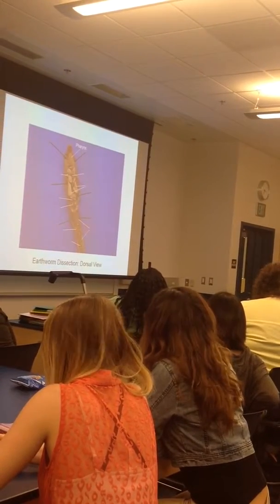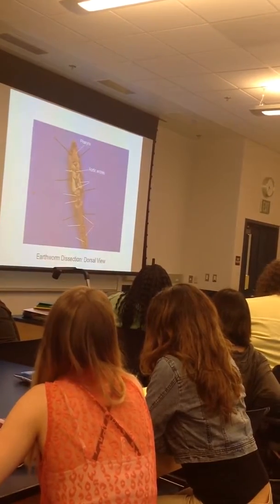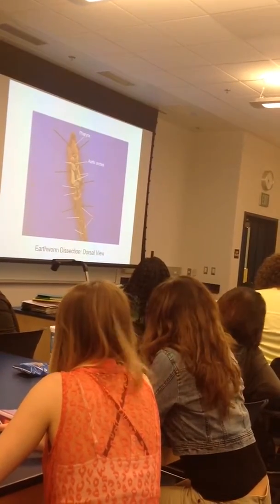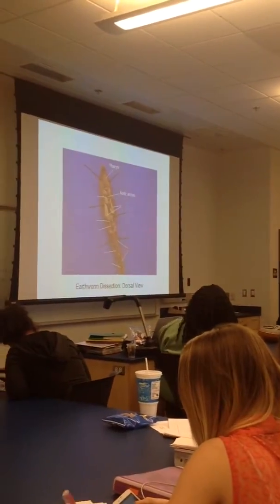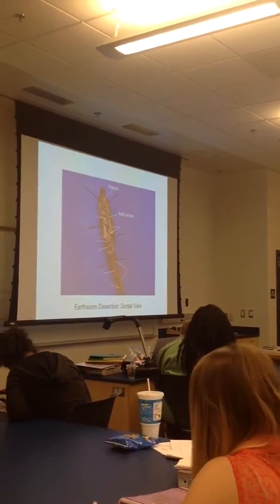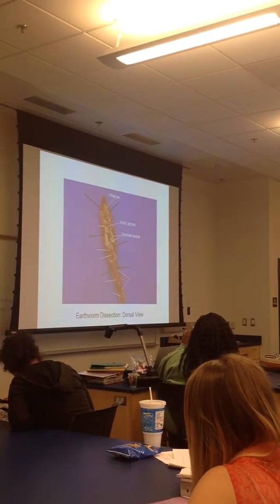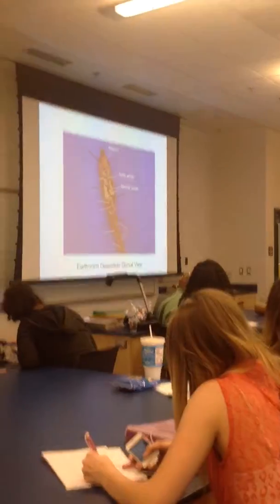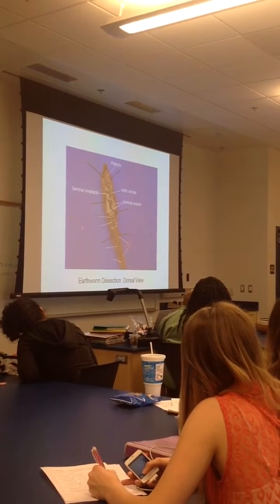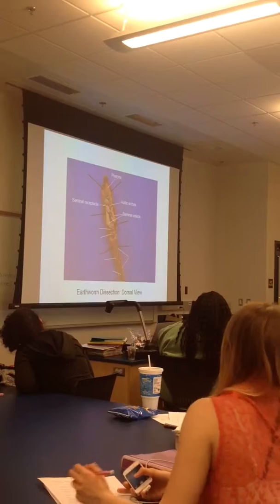This you do. What does this mean? The hearts or aortic arches. Yes, it could be presented either way. What is this here? The vesicles. Now, how did you know it was the vesicle and not the receptacle? They're bigger. Very good. This down here. Receptacles, the small ones.